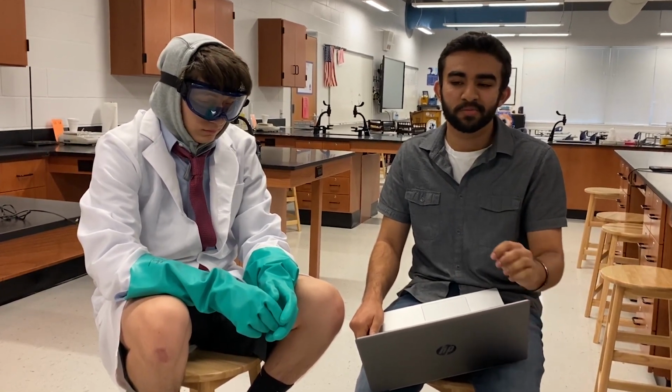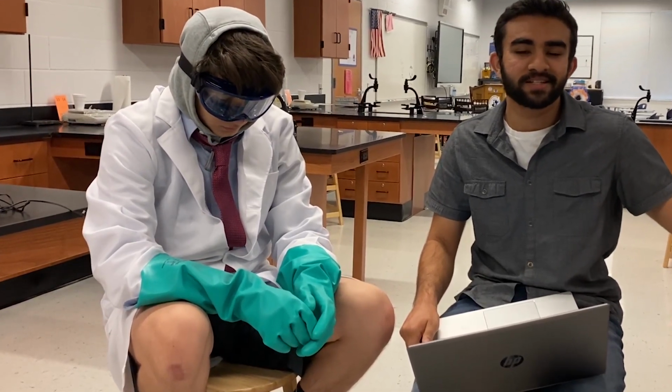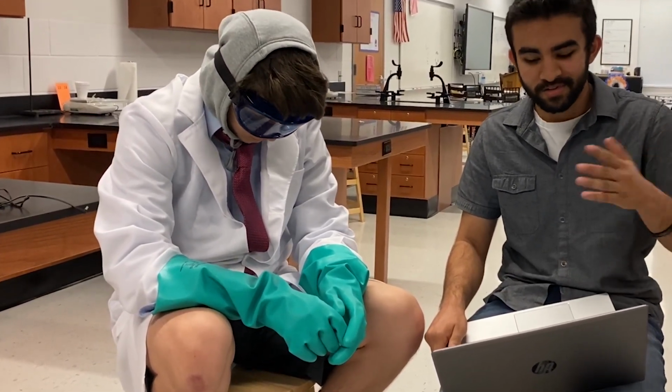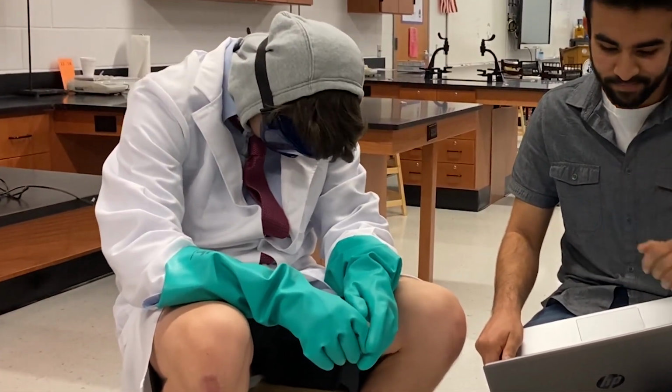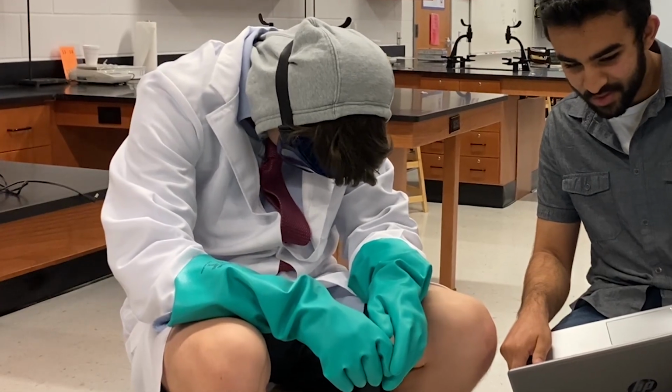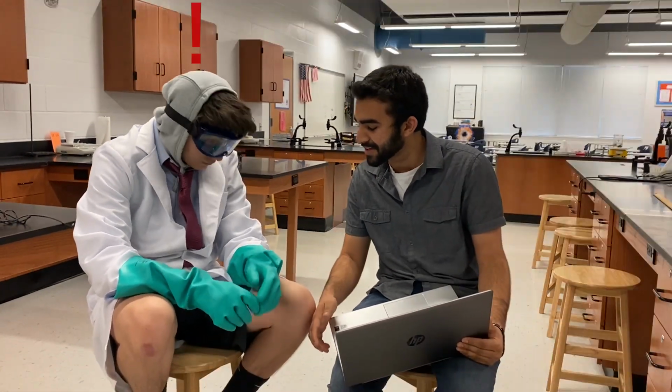Right, kids. And something that most people don't talk about is what you do after the lab, because cleanup is very important. You would want to put all the chemicals back where they came from, and make sure the workplace is properly cleaned, so that the next group, whoever it may be, would have it easy. Anyway, look at 24. I think that's a really important thing.